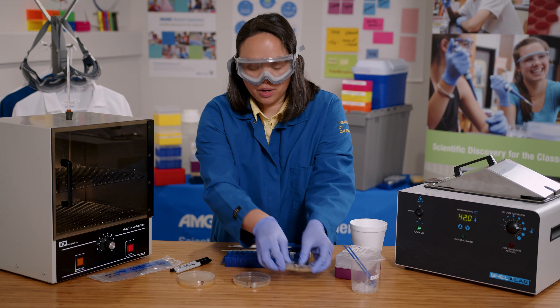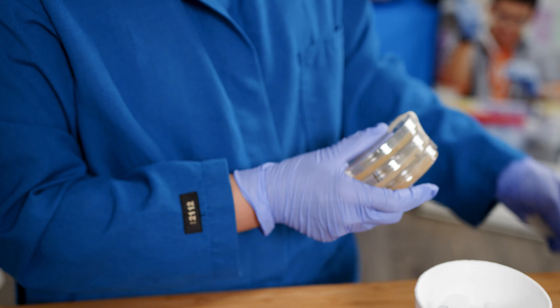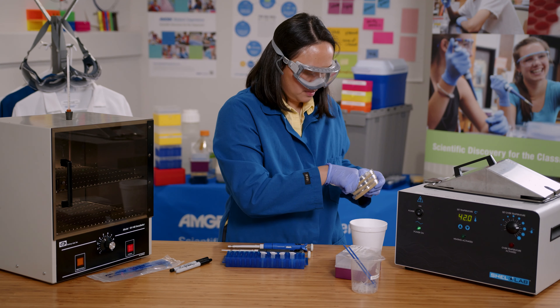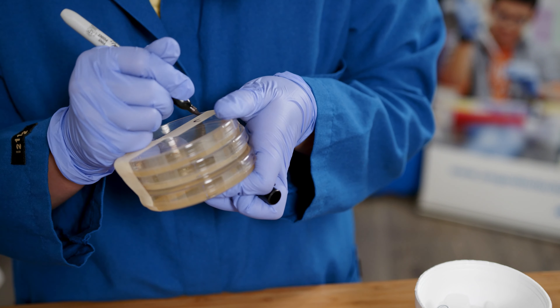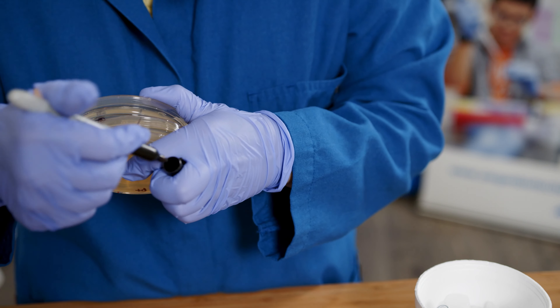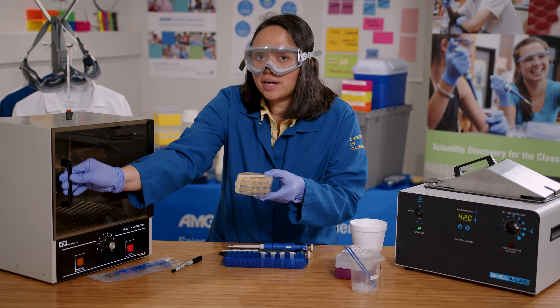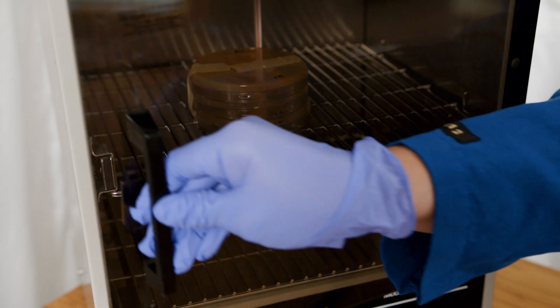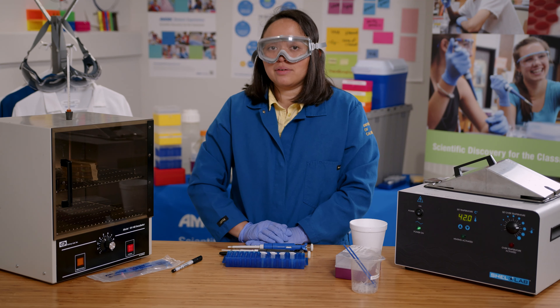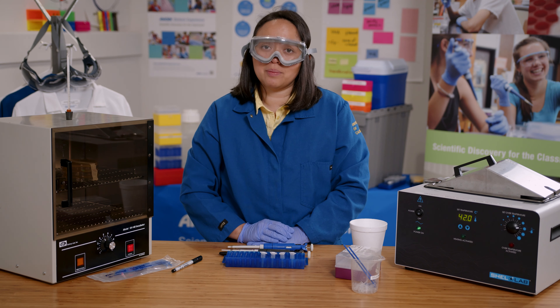Now I'm going to tape all three plates together and label the tape with my initials. Then I'll place the plates upside down in the incubator at 37 degrees Celsius. The plates will incubate for at least 24 hours until we see bacterial growth and hopefully transformed bacteria.